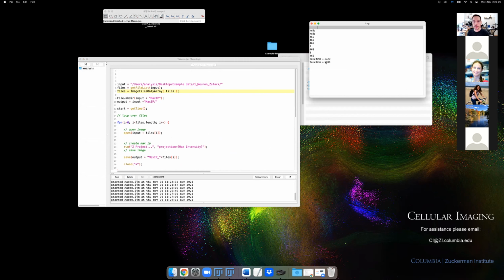This is our total time taking here. You can see it's a little bit messy. Like we're running this and the images are appearing, we are taking care of closing them. Actually, I should explain this to you as well.